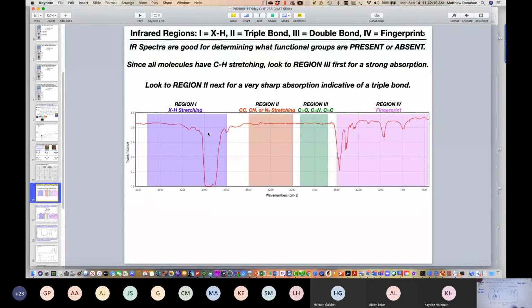So one thing, in my opinion, and again, I don't want you guys trying to go nuts memorizing things, because IR can definitely be frustrating in some sense. Let me just say that when I'm scanning these wave numbers, this x-axis, and I find 1500, I'm just going to draw a line. So anything over here, 1500 and below, for all intent and purposes, you can ignore, because this stuff gets super complicated. Unless you're an expert in interpreting IR, you're going to have a very hard time pulling out of there what that data is. So IR is very good for diagnostic peaks that each functional group has.